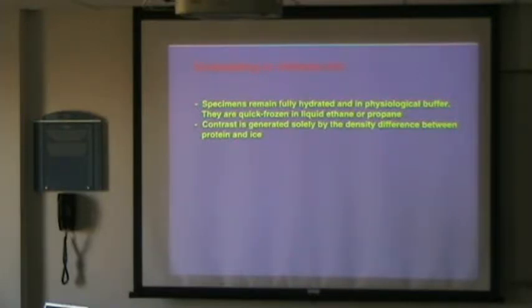You can modify the concentration quite easily. And then the other thing is you have a quick freeze effect. So you just freeze anything in a conformational state. Sometimes if you can coordinate that, you will be able to actually look at distinct conformational states in a protein.